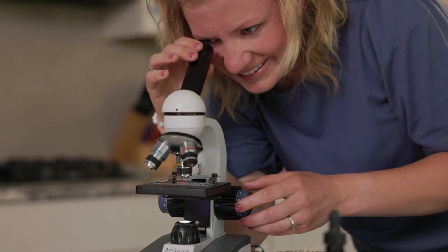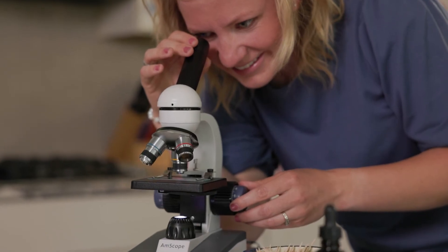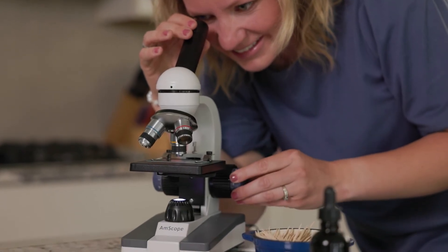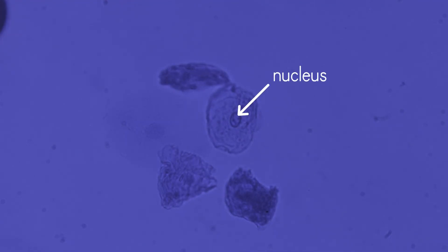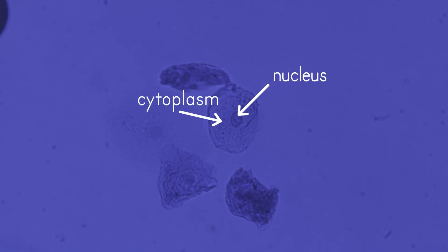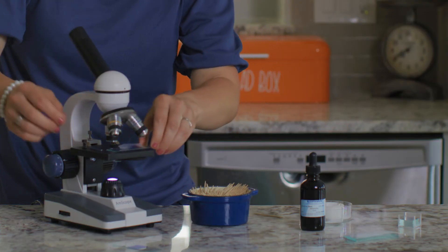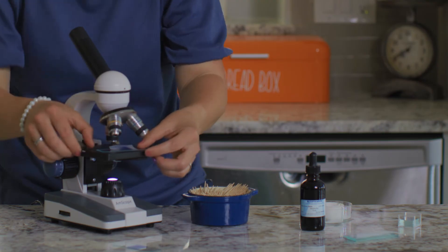Let's take a look at some skin cells from inside my cheek under the microscope first. Take a look at this. The dark blue circles you see are the nuclei, the command centers of the cells. The light blue color surrounding each nucleus is cytoplasm, and the outer circle is the cell membrane. Do you think the skin cells from my wrist look different than the ones from my cheek?